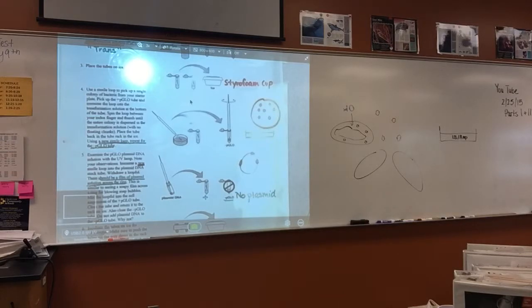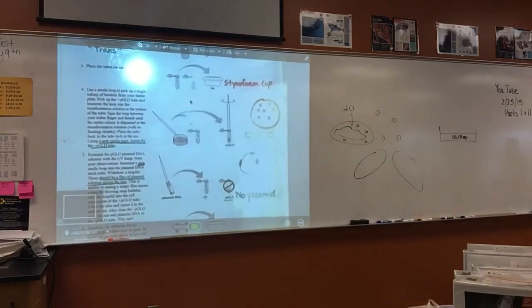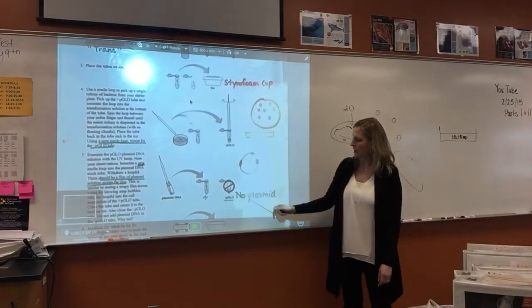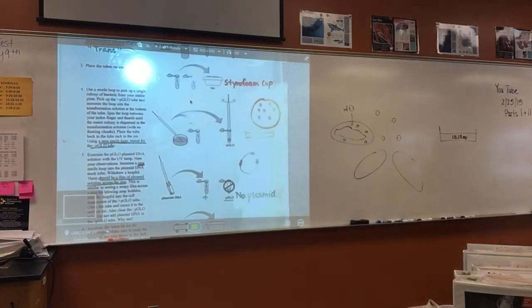When you come up here though, the purpose of this is you're going to mix the plasmid with just the positive pGLO bacteria. Notice the negative pGLO, you're not going to put any plasmid in, so we're just going with this. Two people need to come up here to do this. One person holds the little vial that has the bacteria. The other person has to take a new sterile loop and stick it into the solution.